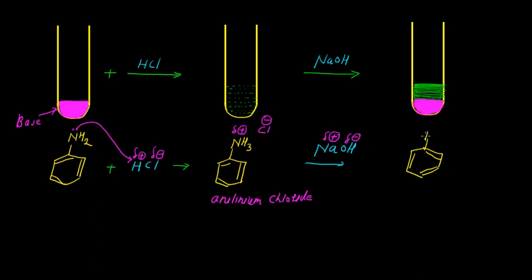Here aniline is a liquid, and you can see the two layers in this test tube. It indicates that the regeneration of original aniline takes place, and simultaneously in that test tube we get sodium chloride as a side product plus a water molecule.